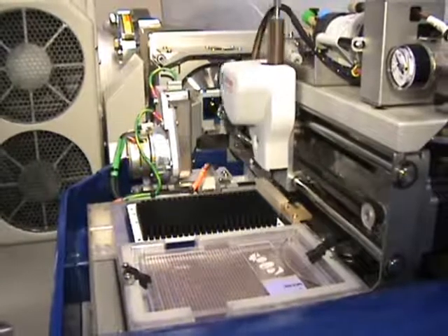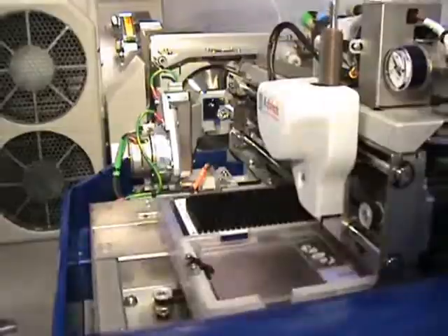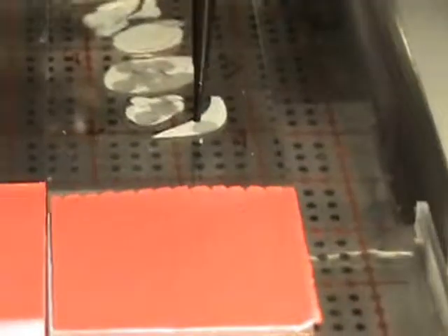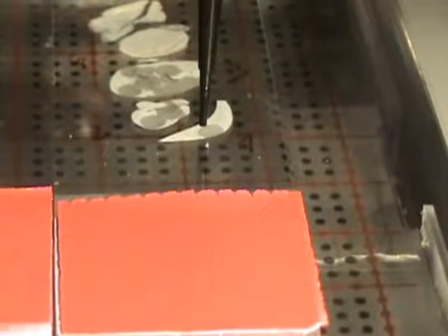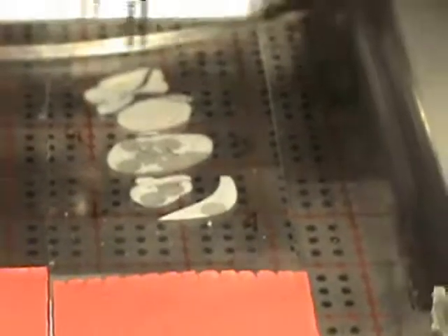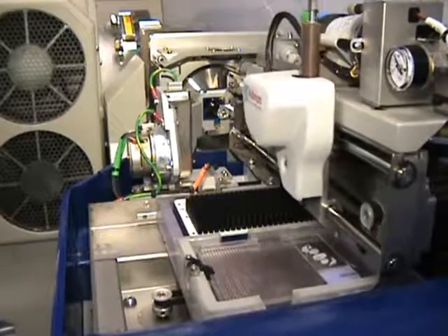Then, the solvent is carefully dispensed from the pipet tip and held in contact with a pre-programmed position just above the sample surface held on the sample plate. The analytes are extracted from the surface into the solvent, and the solution extract is withdrawn into the pipet tip.